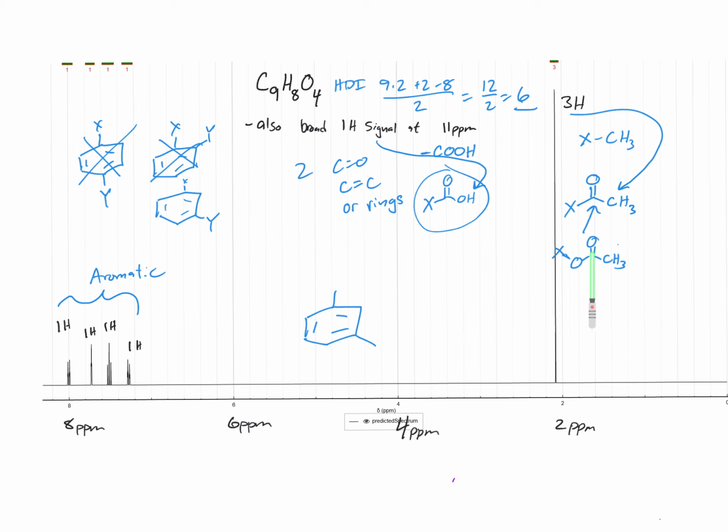So that wouldn't really help us solve this problem. It wouldn't correspond to the formula. But of course, one of them can attach here, the other can attach there, and then I believe we'd basically be done with this problem. Let me fix my drawing here. So I got a carboxylic acid there, and then I have an oxygen, a carbonyl, and a methyl group. And so I believe that this is the complete formula.